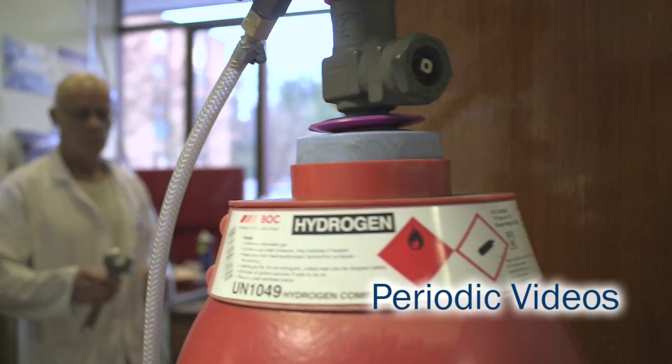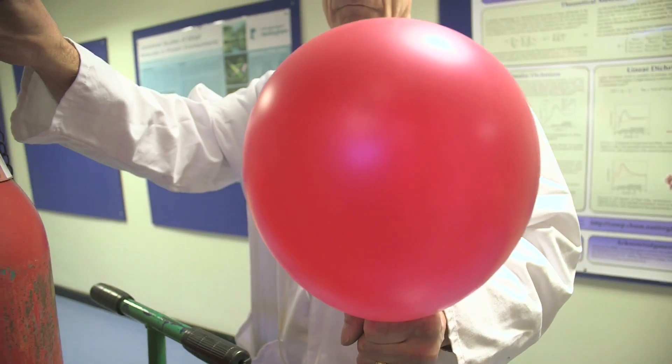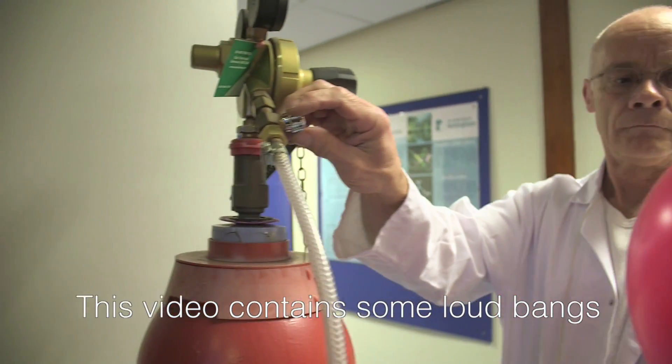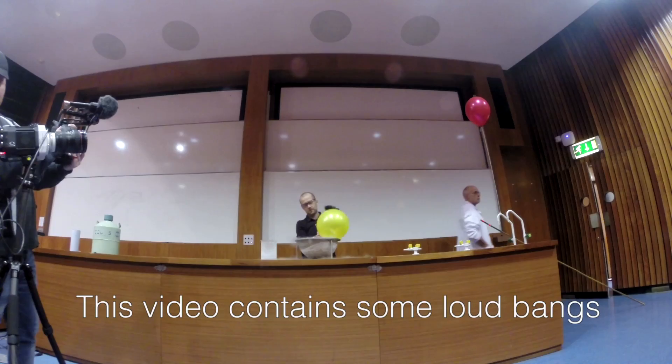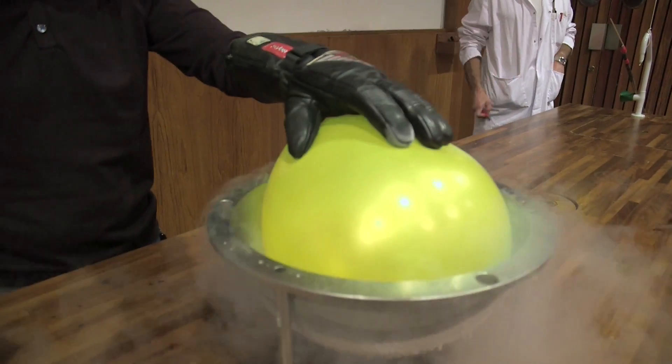Brady, Neil and Darren have done another slightly strange experiment. They decided to cool balloons down — balloons containing hydrogen — with liquid nitrogen.